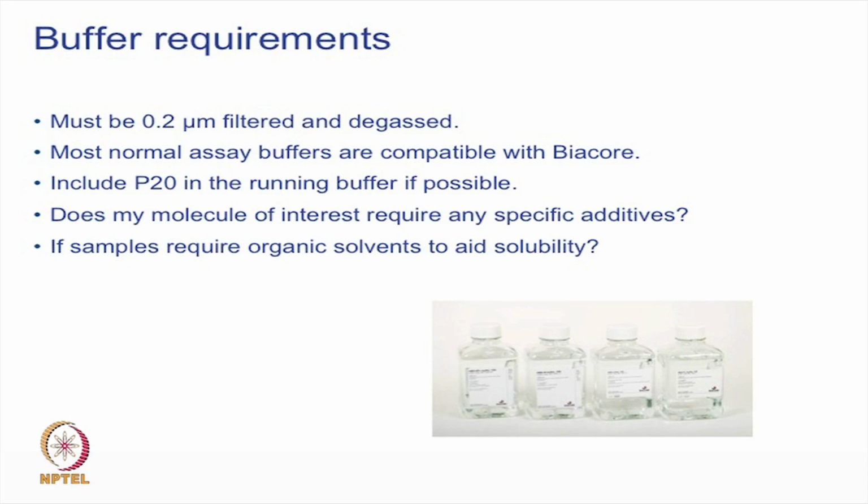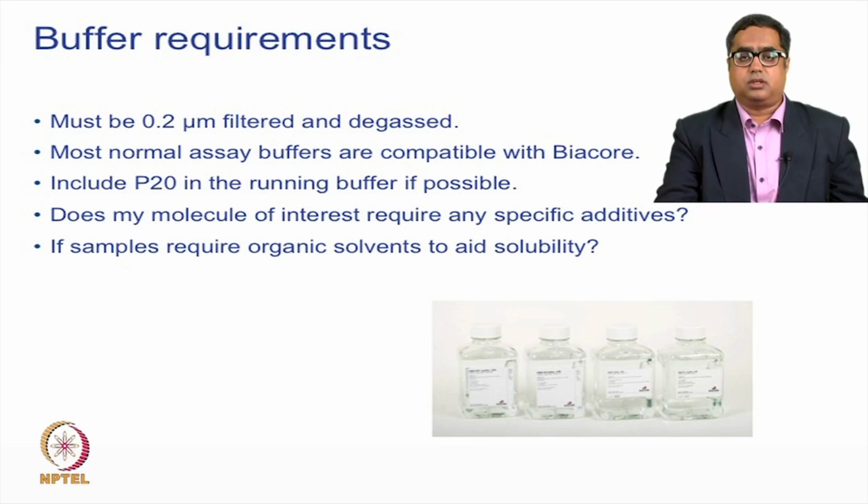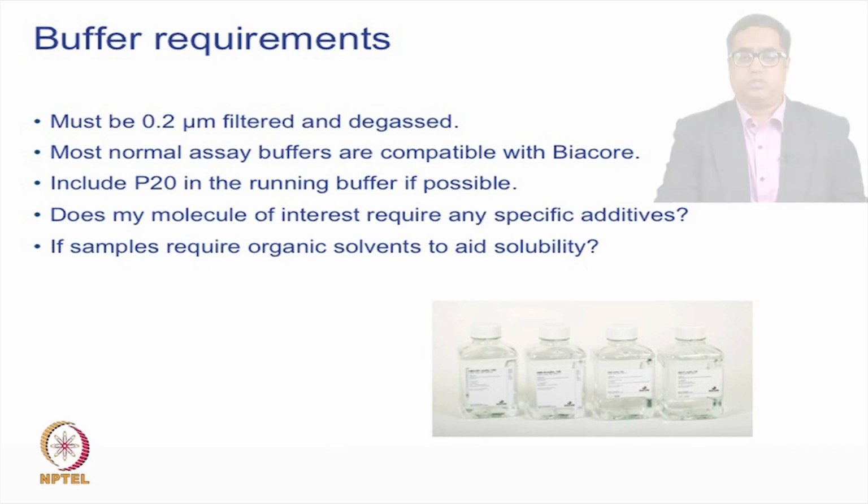Sometimes some additives are also required for your running buffer, like metal ions or other activating molecules, activators. All of these need to be added into your running buffer or sample buffer to maintain conditions for your experimentation. And when we filter and degas, we need to check for proper filters which are compatible with water and organic solvents.